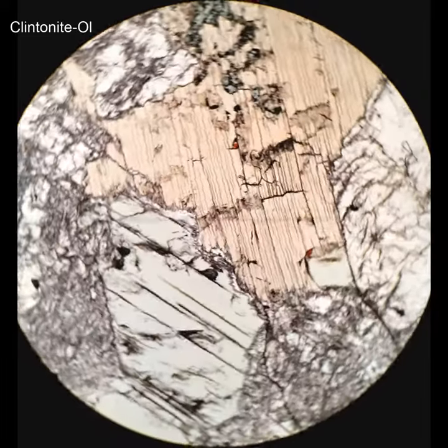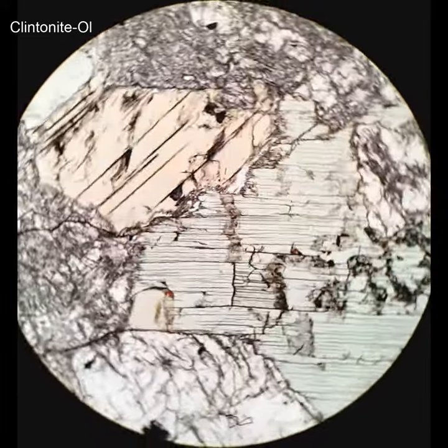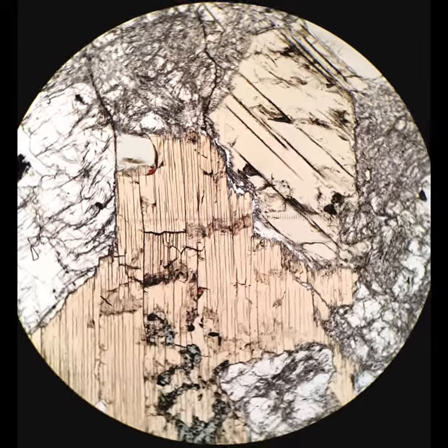Here are some larger grains, and you can see the orange to green pleochroism that's so unusual about it.